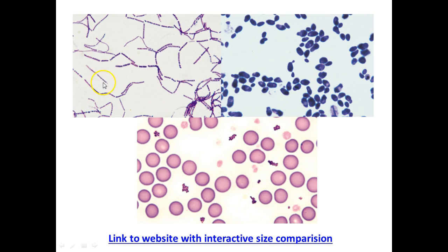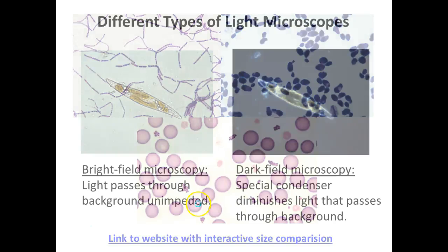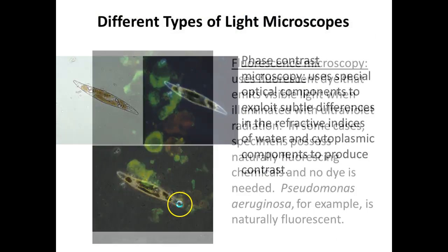You're going to see rods, and you're going to see cocci, right? In different arrangements, like these are clustered up, these are forming chains. You'll see them all by themselves. The eukaryotes, which we're going to look at next week and that you're going to do for homework, those are the exciting ones. Although students don't usually look forward to them because you have to know all their names and identify them. All right. I do still have 2 more slides.